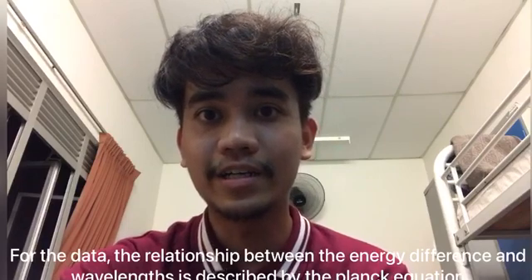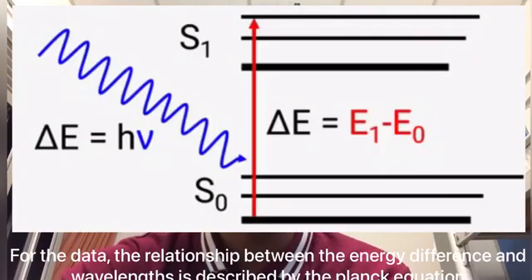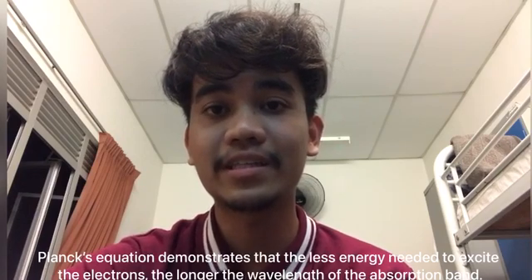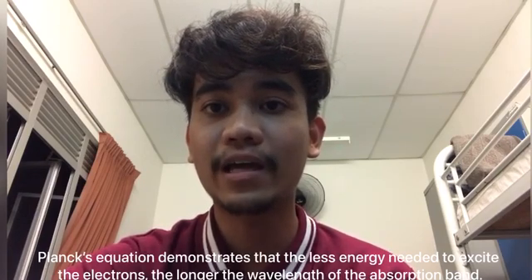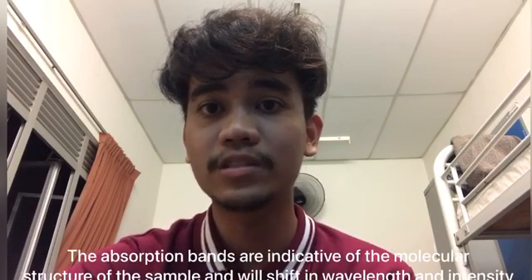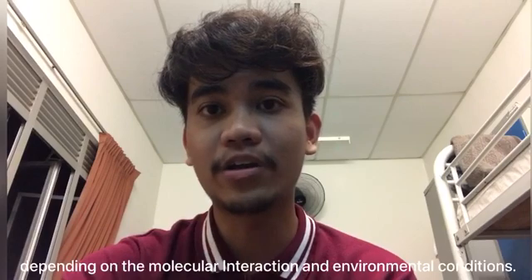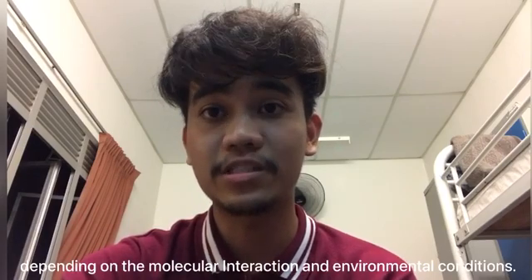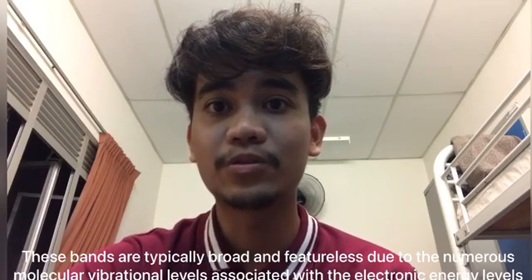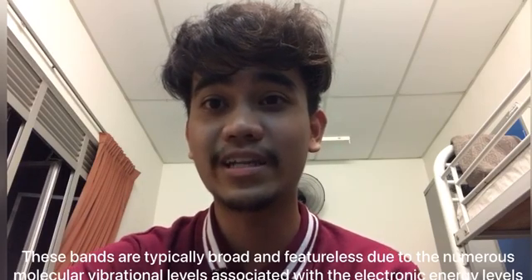For the data, the relationship between the energy difference and wavelength is described by the Planck equation. Planck's equation demonstrates that the less energy needed to excite the electron, the longer the wavelength of the absorption band. The absorption bands are indicative of the molecular structure of the sample and will shift in wavelength and intensity depending on the molecular interaction and environmental conditions. These bands are typically broad and featureless due to the numerous molecular vibrational levels associated with the electronic energy level.